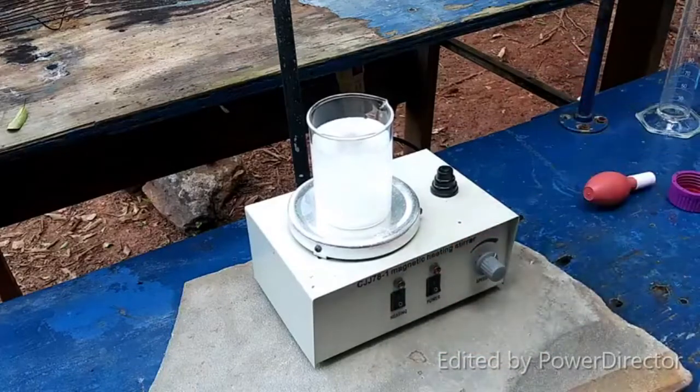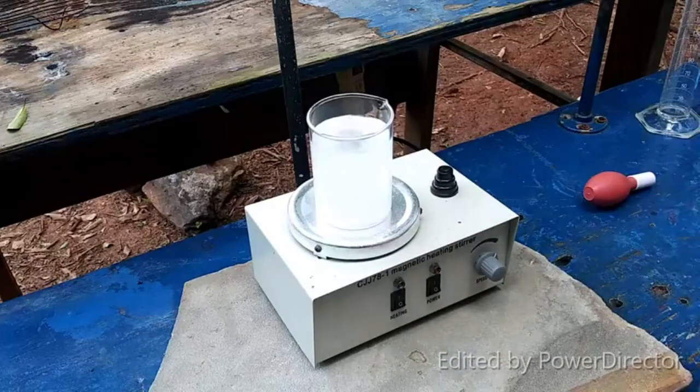Turn on the heat and we are going to let this stir until everything dissolves. Then we have to cool it down to between 40 and 50 degrees C.